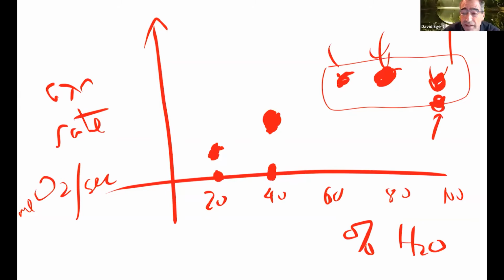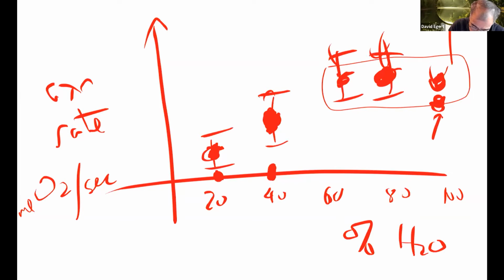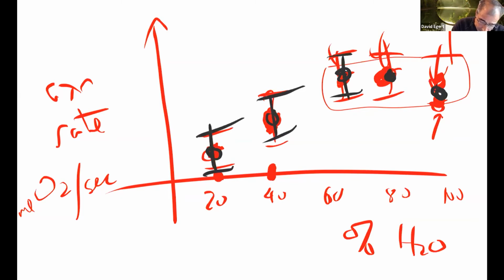I would say any of these things that you calculate is going to be some range of what it really is, based on just the wiggle room of where exactly you draw your best fit line, and just how sloppy the bubbles are and everything. If you have an actual dot on your graph, the real number is probably in some error bars around that dot.